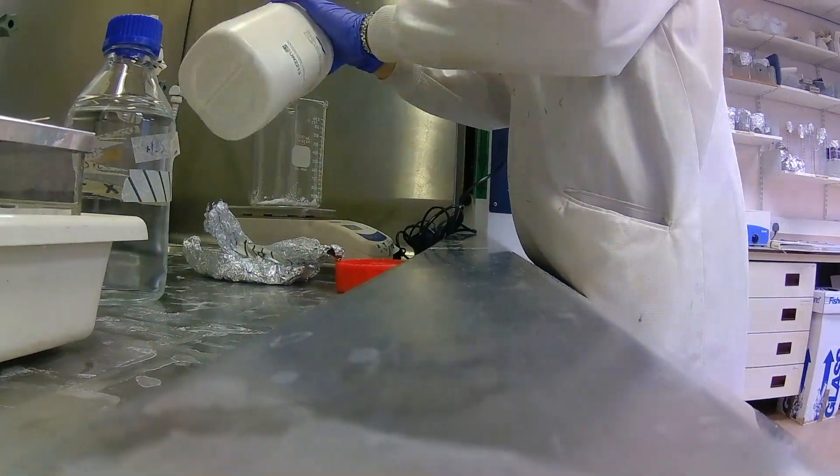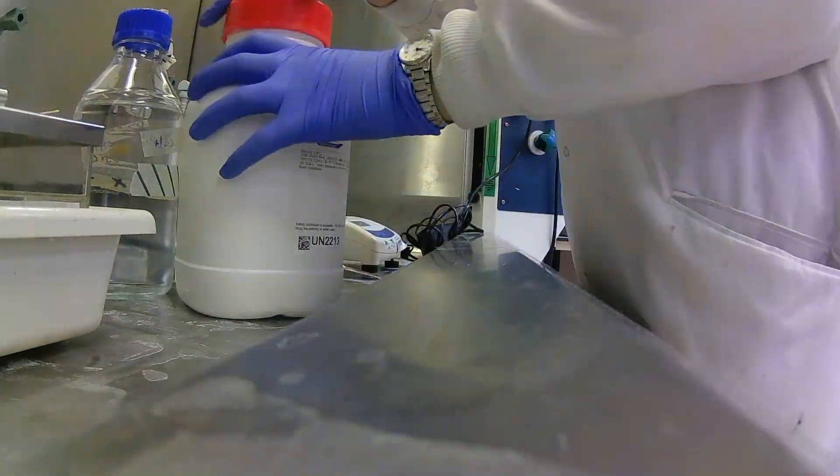Now before I put the probe on the brains, I need to prepare the brains a little bit. The brains were taken, they were frozen, they were sliced, they were frozen again — so nothing else has been done to them at all. What I need to do is fix them and get rid of the excess water molecules.